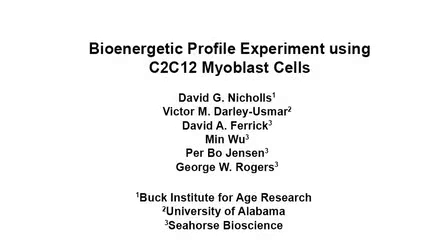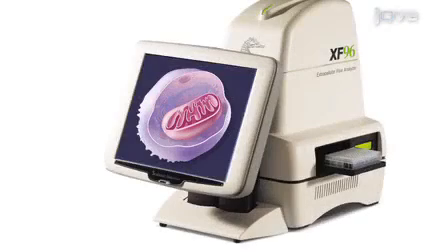The overall goal of the following experiment is to test the functional status of mitochondria in living cells and isolated mitochondria by measuring multiple parameters of oxidative metabolism using the XF96 extracellular flux analyzer. These parameters are basal respiration, ATP turnover, proton leak, and maximal respiration or spare respiratory capacity.